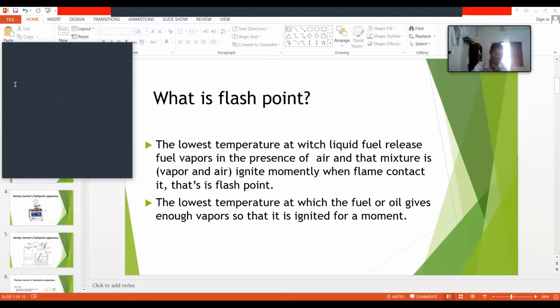Prem Ratna? Yes, sir. Were you still here all the time while doing this practical? You are here. Yes, sir. Then tell me what is the flash point we found for the diesel? 59. No. I think I am not clear.